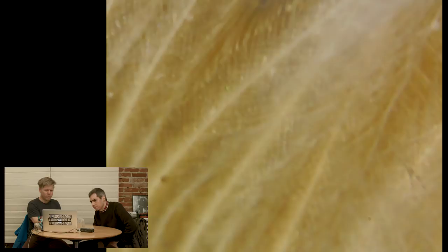I don't think the white looked good before. Well, you know, that's kind of what I expected it to look like. To be honest with you, Brian. Okay, here's a skull. I want to say it's a squirrel, but let's confirm with Mary. We're going to have to go 40x on it.